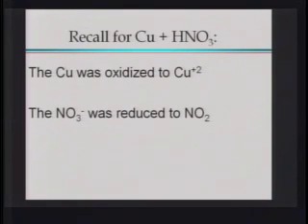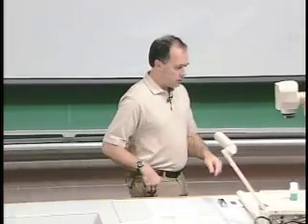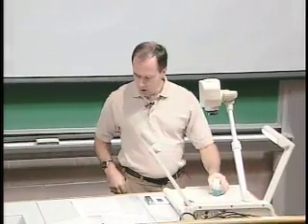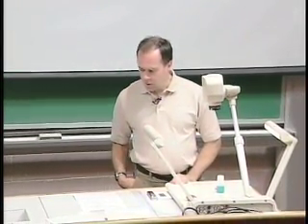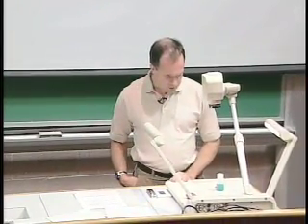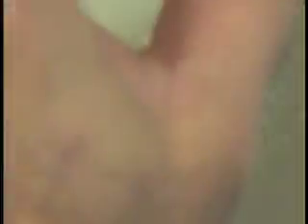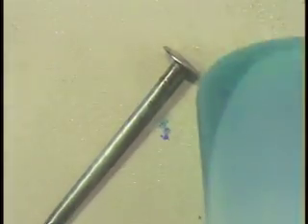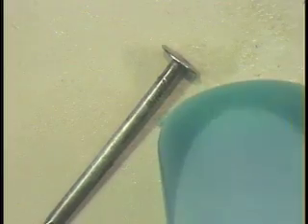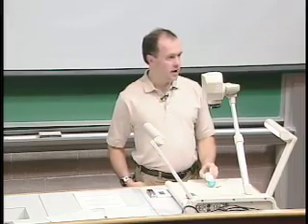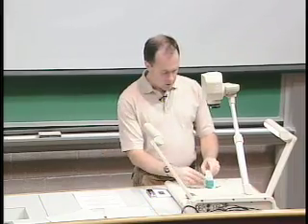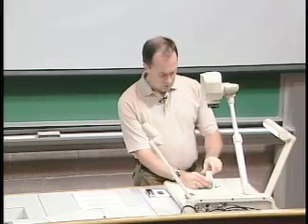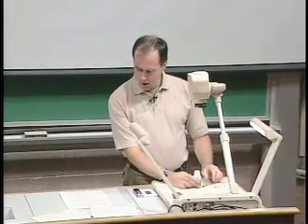I'll just do a quick demo for you. What I've got here is a steel nail — an iron nail — which I've cleaned up with a bit of steel wool so that the surface is nice and shiny. And in this vial I've got a little bit of copper nitrate and a little bit of acid as well. The acid is necessary just to make this reaction go fast.